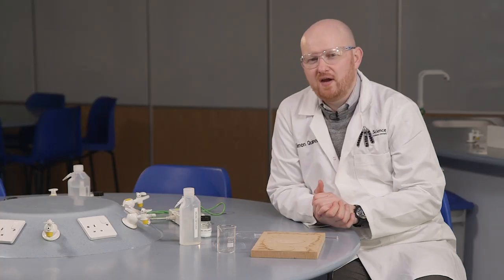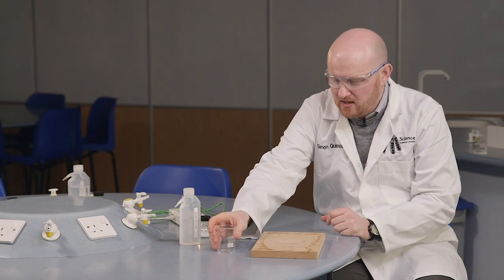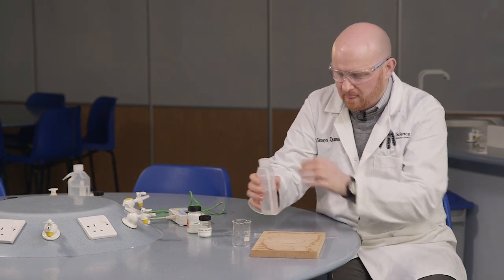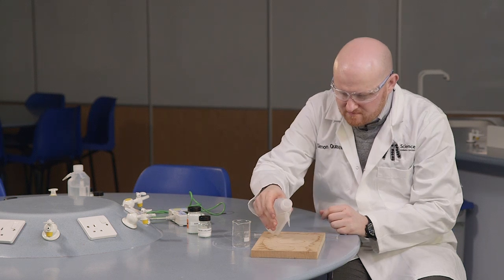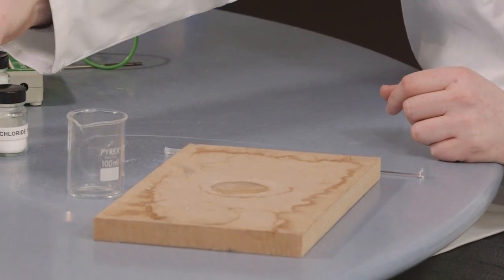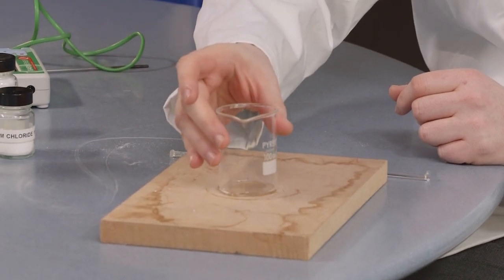Now, the endothermic reaction is all about heat energy, and an endothermic reaction takes in heat energy. And what we're going to do is take some water and put it onto our wooden block. I'm going to put our beaker on.